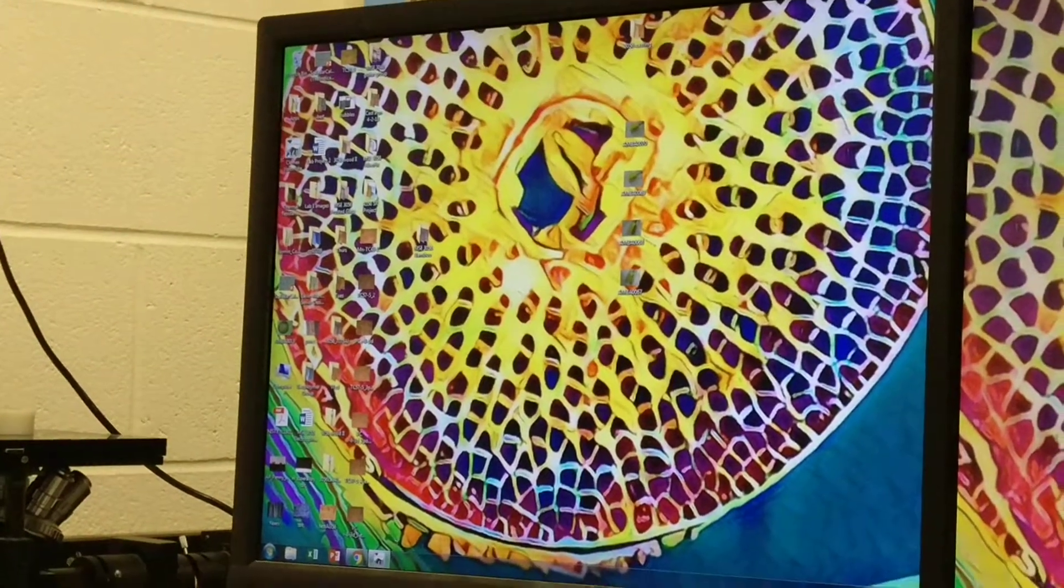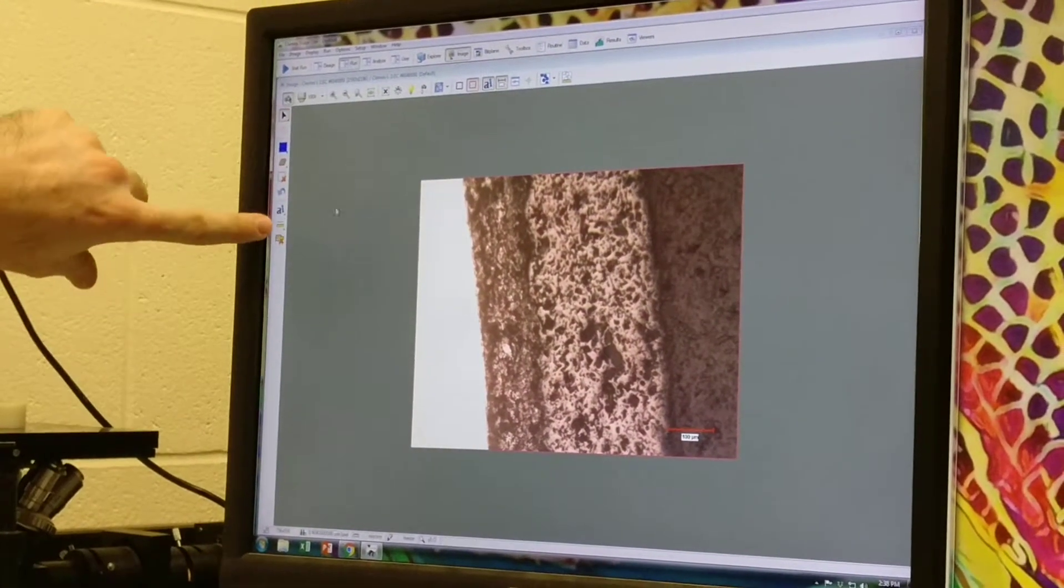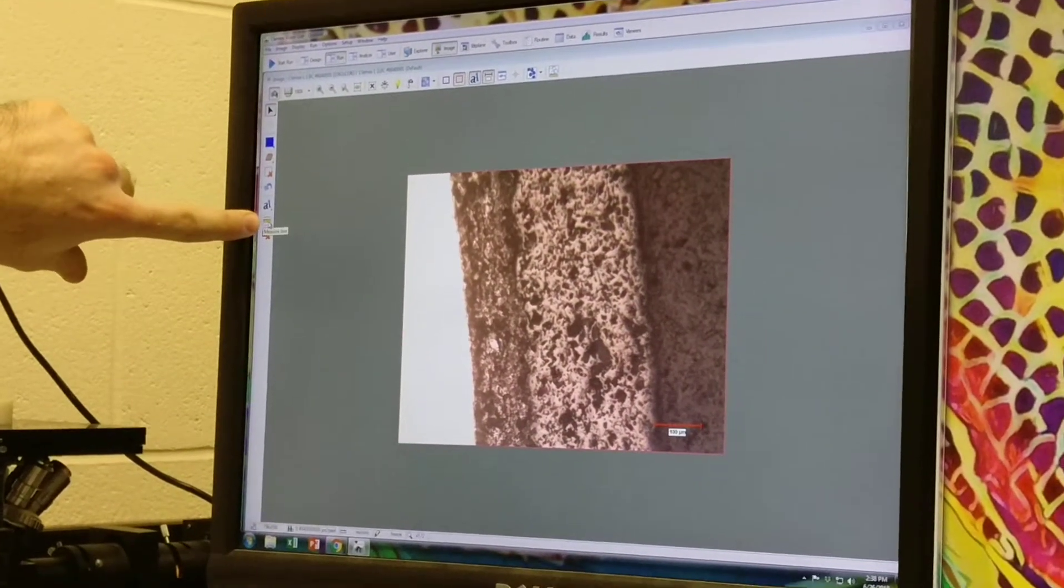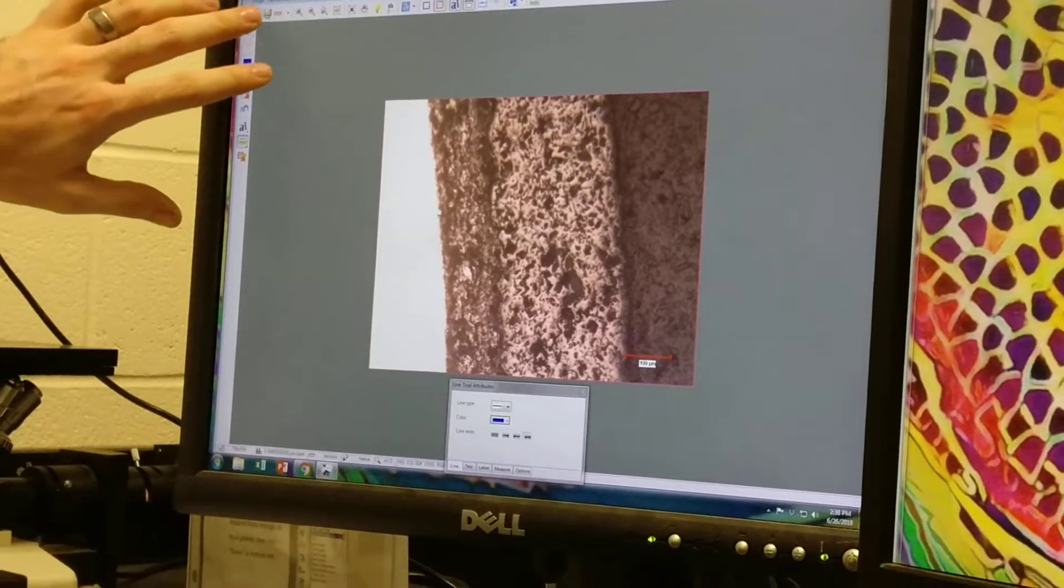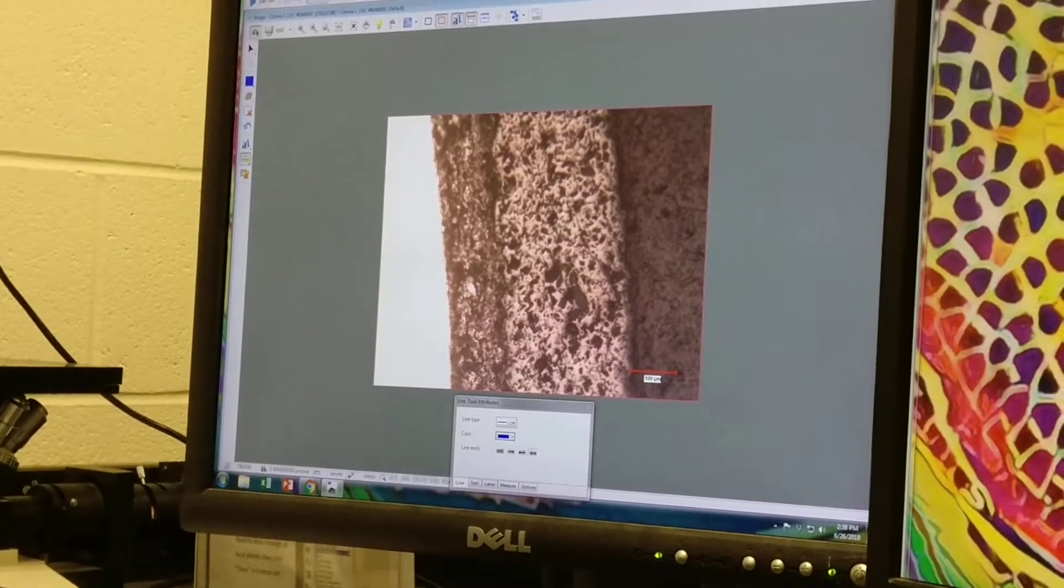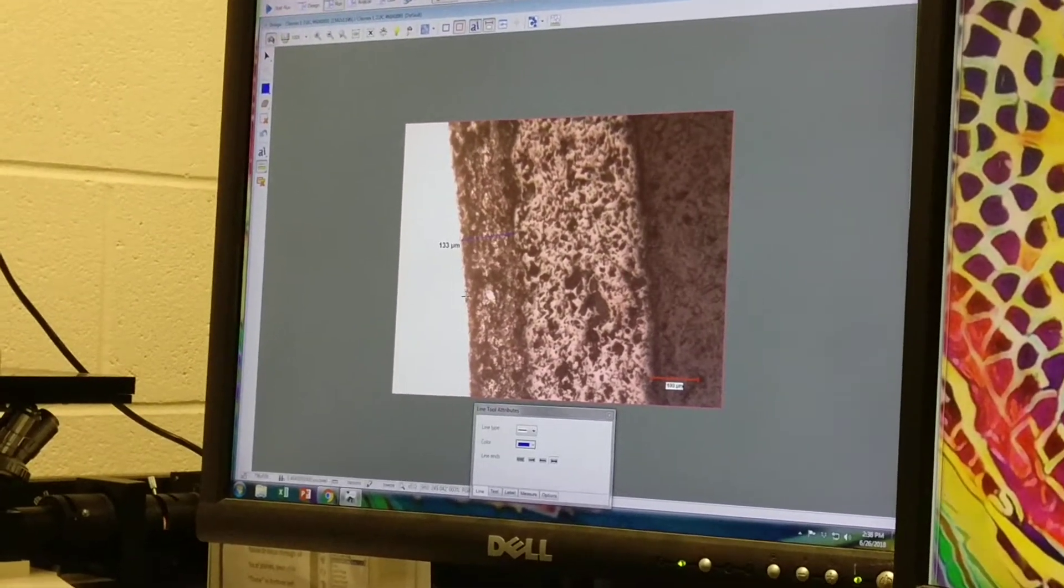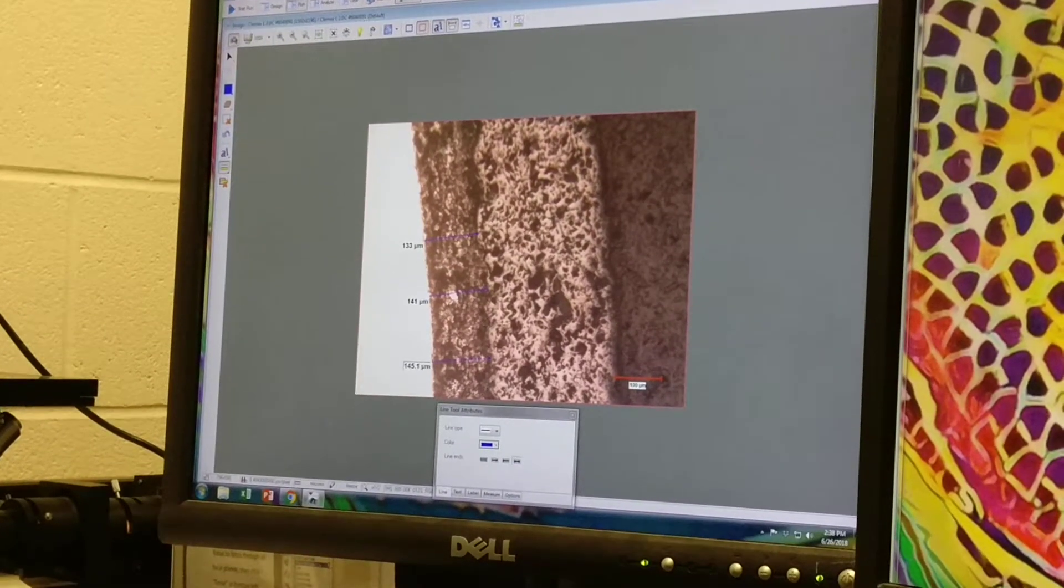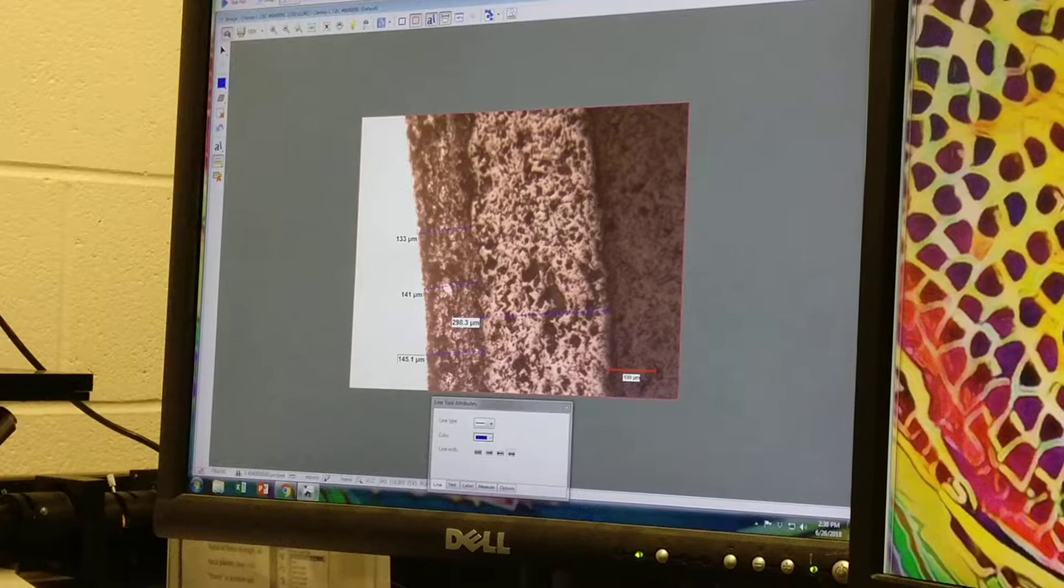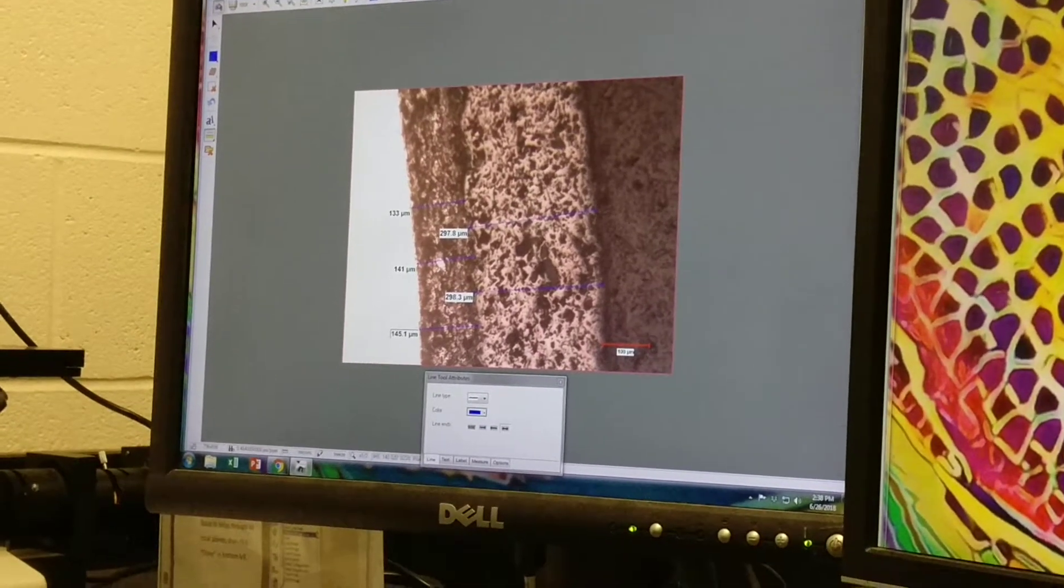Now if we want to measure the thickness of those layers, we'll go back to our software and we're going to click this little ruler button over here to measure a line. Make sure that we're on the correct magnification here. We'll click and drag from one interface to another. We'll do maybe an average of three lines on both layers and take the average and standard deviation of those measurements for our report.